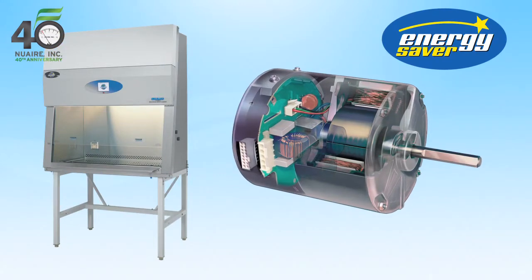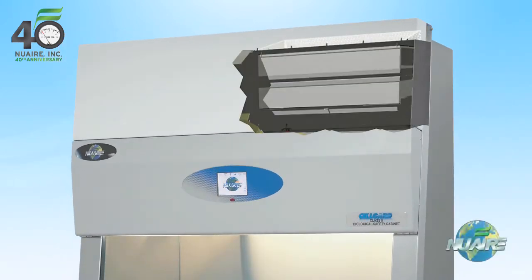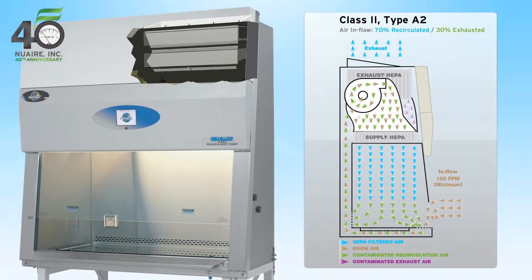Designed with an ultra-high-efficiency DC-ECM motor, CellGuard ES reduces energy consumption while maximizing filter load capacity. NuAir uses the largest HEPA filters with more filter media. Combined with the DC-ECM motor, new air filters last up to 10 years or more.